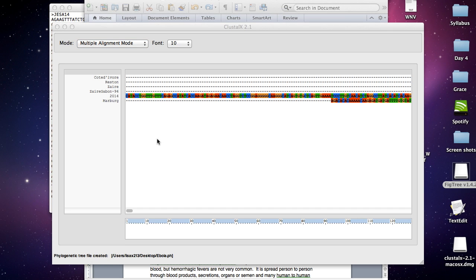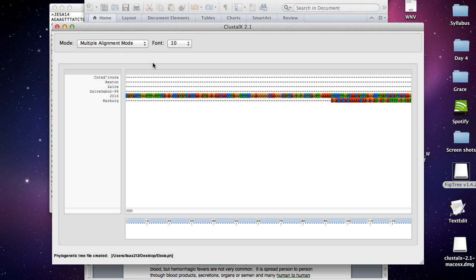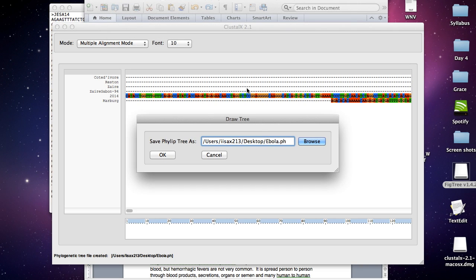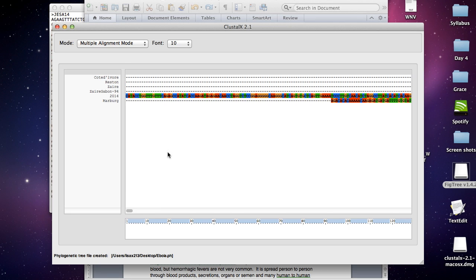OK, we're back. Finally it finished aligning all the sequences. Now we can continue and actually calculate the genetic relationship of the sequences by clicking trees, and then draw tree. Then it prompts you to save a .ph file, which is good. Click OK.